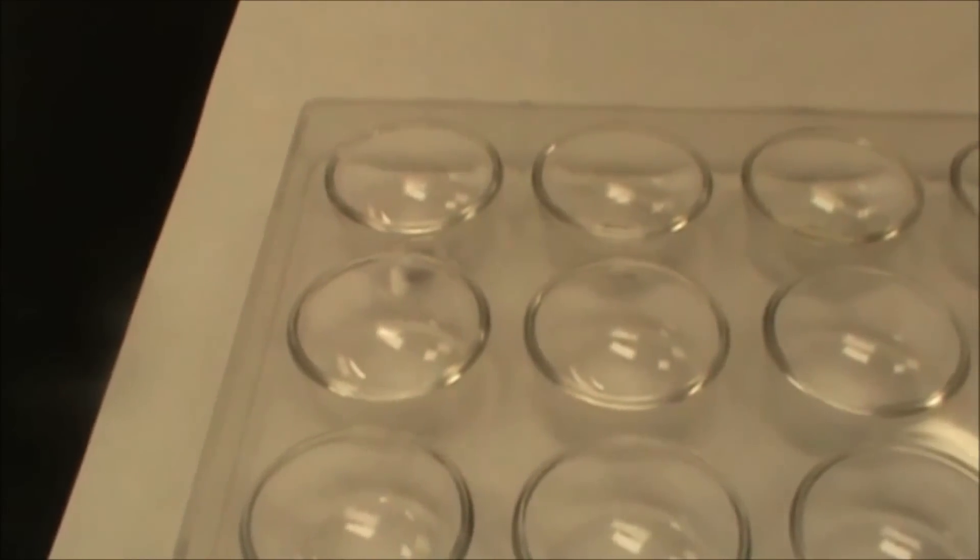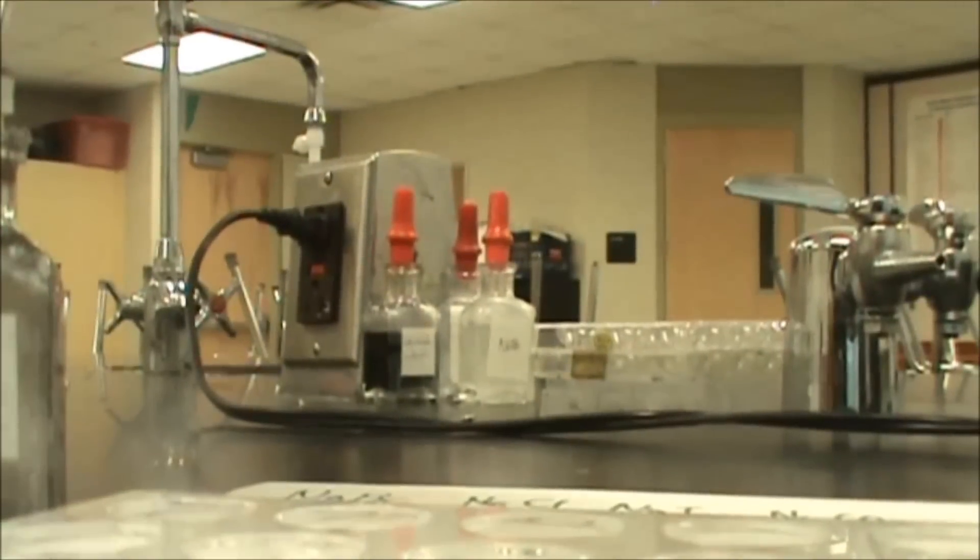So then what I'm going to do is I'm going to take silver nitrate and when I mix a drop of that with each one, then it's going to form a precipitate for each one, and they're going to be slightly different for each one.